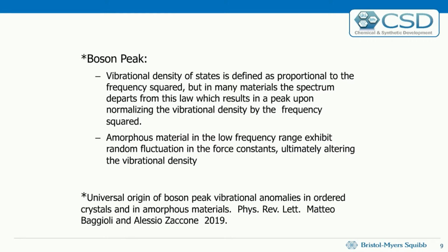Now, traditionally, I know it as what Felix Franks would say, it's ordered randomness, or you've got a small amount of ordered material, crystalline material, that's embedded in a random area. So you don't have enough to have a fully crystalline repeating state.